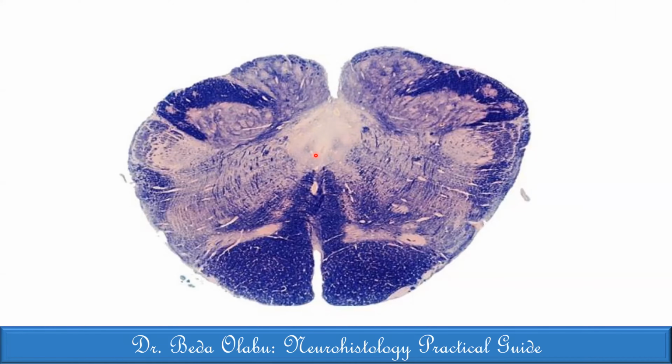Just to add on what Mokaya has said, you can see that there are the pyramids on the... yes, and then you have identified the medulla. This is the medulla. So the blue darkish fibers that he was referring to are actually the decussation, that is the pyramidal decussation at the level of the closed medulla.